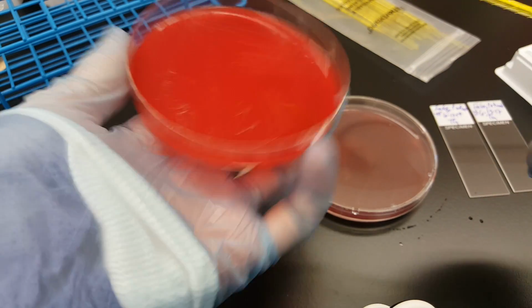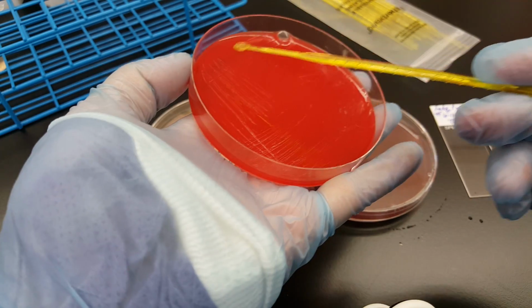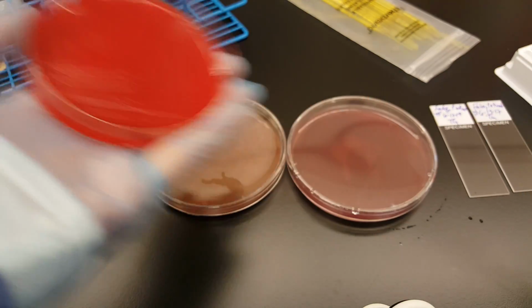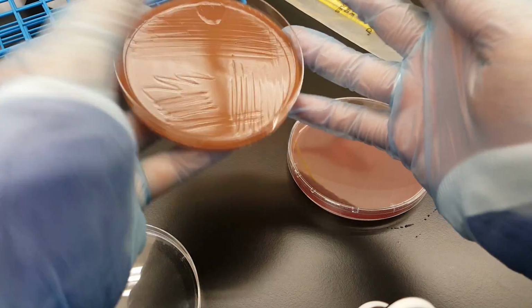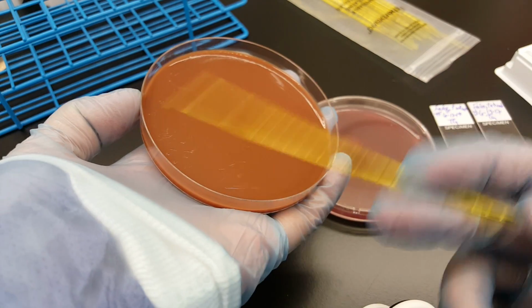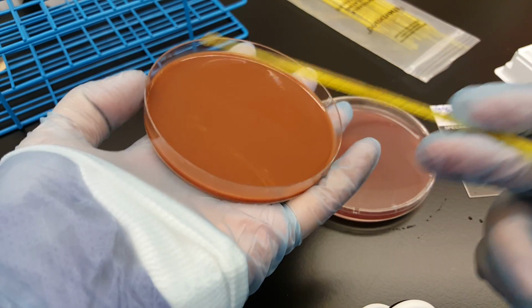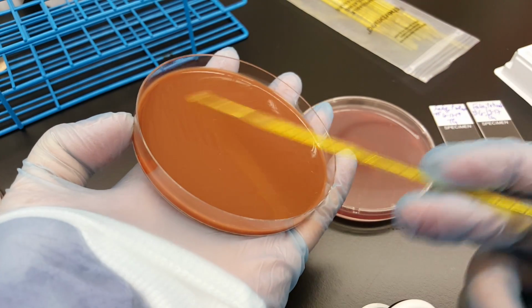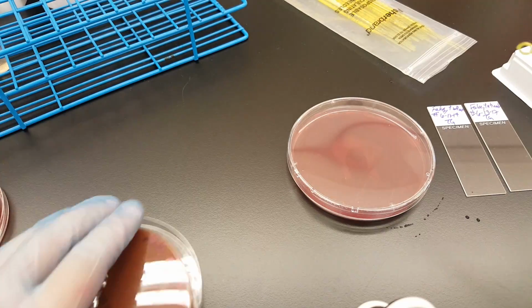Okay, spread it, go in twice, go in twice, and once. Okay, next one, spread it, make sure that all the wetness is going away, go in twice, go in twice, this time it's going to be better, there we go.